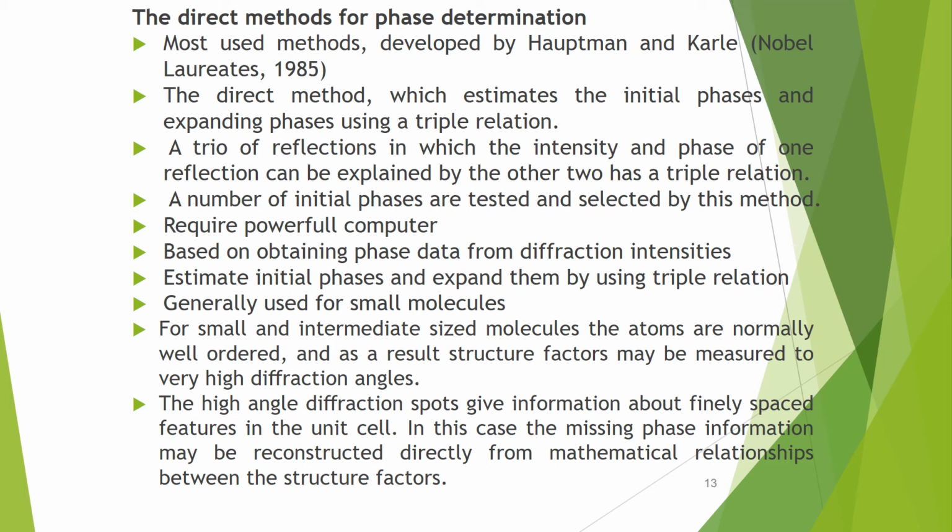For small and intermediate size molecules, the atoms are normally well ordered, and as a result, structure factors may be measured to very high diffraction angles.